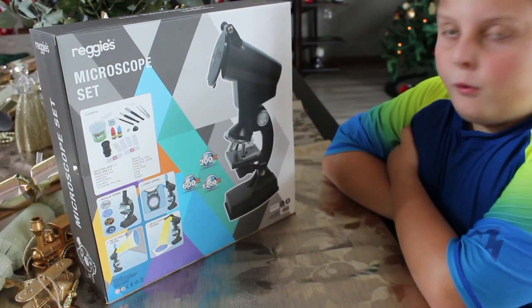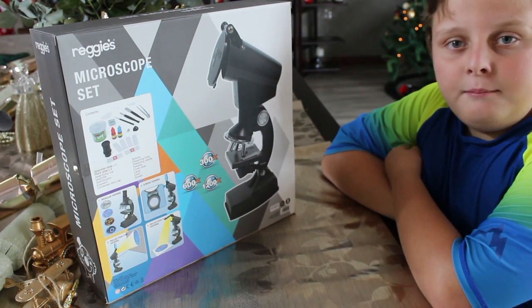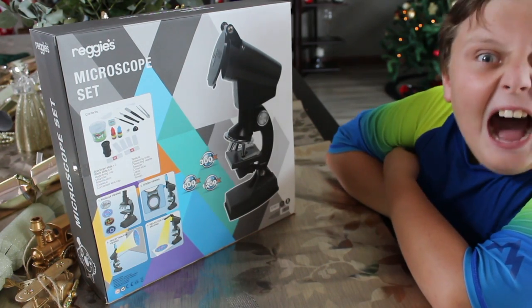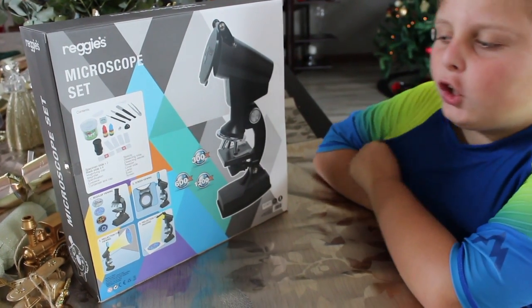It has three powers: 300 times, 600 times, and 1200 times. Now that goes far.